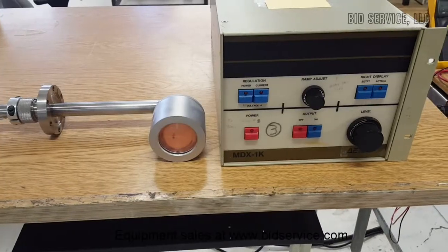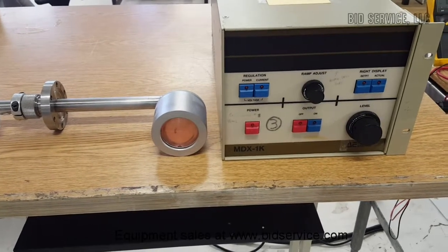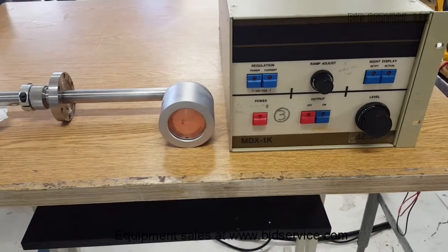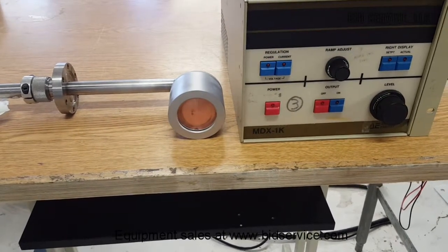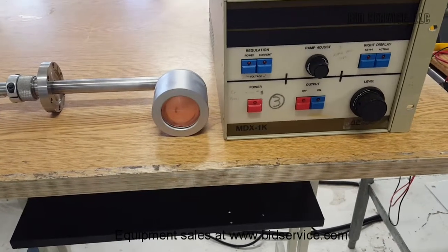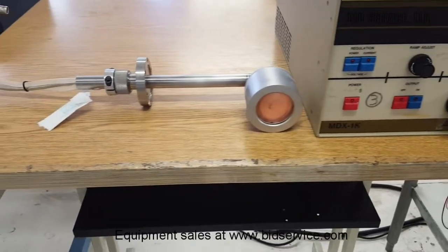This is a demonstration of the Advanced Energy MDX1K DC magnetron sputtering power supply and magnetron cathode. This DC magnetron cathode has a two-inch diameter target. It has a power output of 1,000 watts and is powered by 120 volts AC.